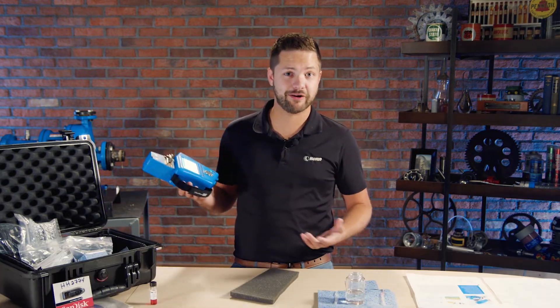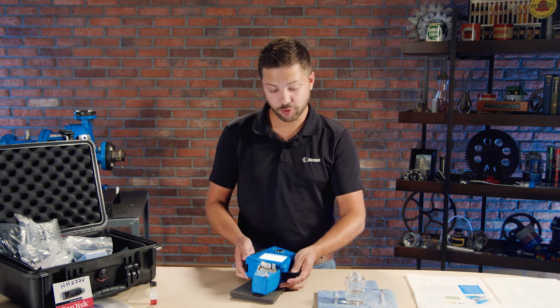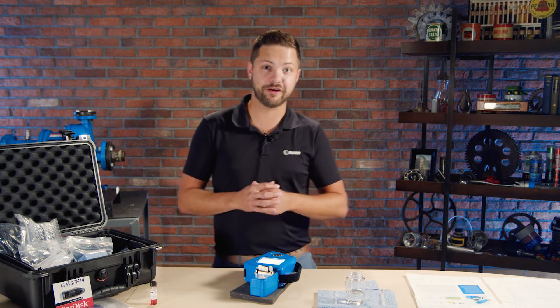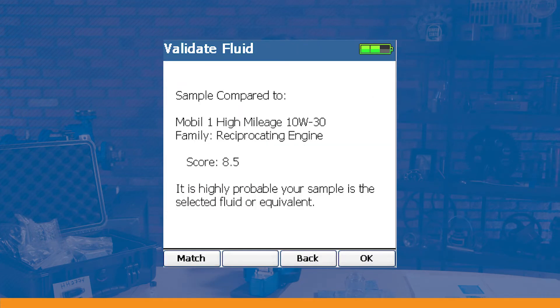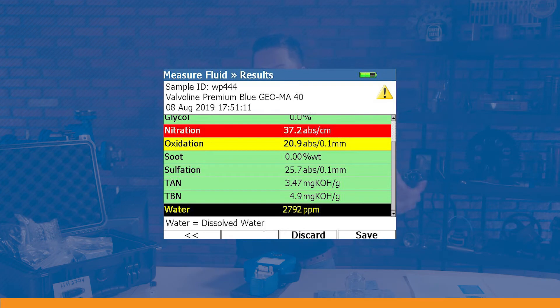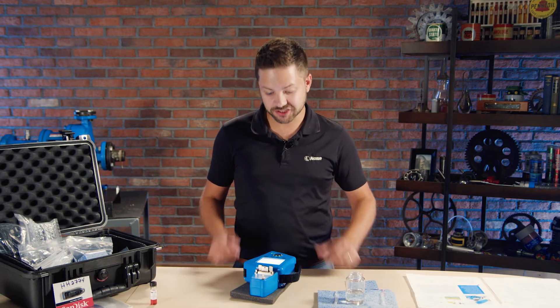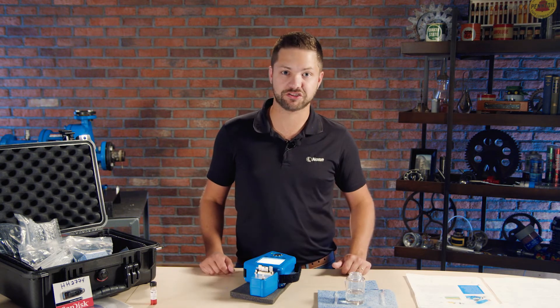Not to mention it's handheld, so I can walk around to different machines and test the oils, or just keep it on my desk. It is battery powered, so the options are yours. This really can be used for any kind of application — turbine systems, hydraulics, compressors — and anyone who's operating those machines or is in charge of monitoring their condition. Condition monitoring fluid analysis is a crucial part of overall condition monitoring.